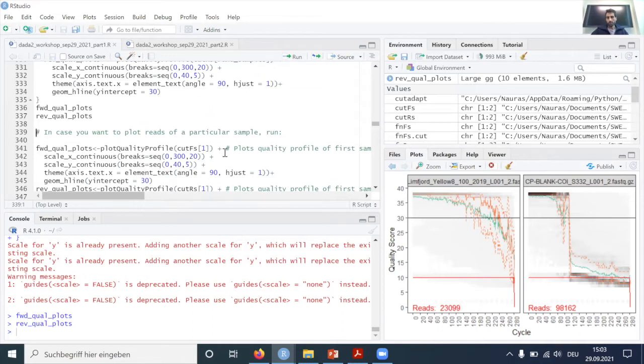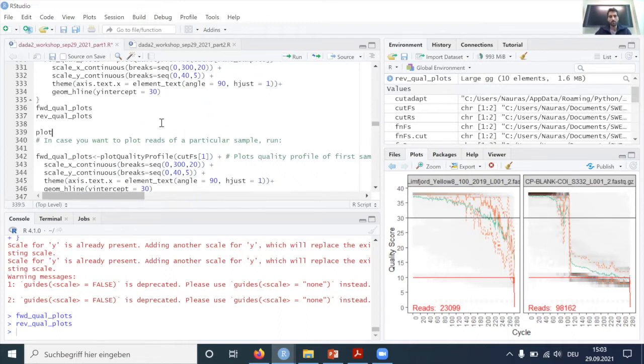What you can also do, I know that Christina has introduced FastQC for quality plotting of your reads even before you start the whole pipeline, and you can of course do this. For example, we could just say that we would want to plot the quality of our reads before we do cutadapt. So this is the path I have for my forward reads, which I have determined before.